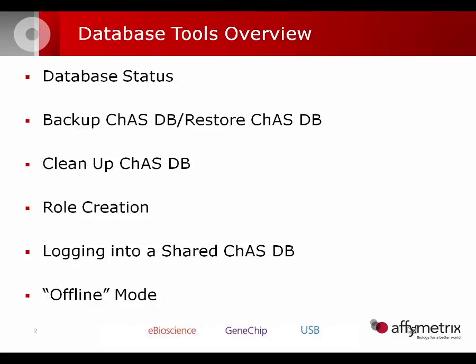We will learn how to back up as well as restore a ChAS database. We will also see how to clean up the ChAS database. The ChAS database does have a script that runs automatically that will reindex itself and clean itself up, but if you find that your database might be running a little slow and you want to try a manual cleanup, we'll see the link on how to do that.